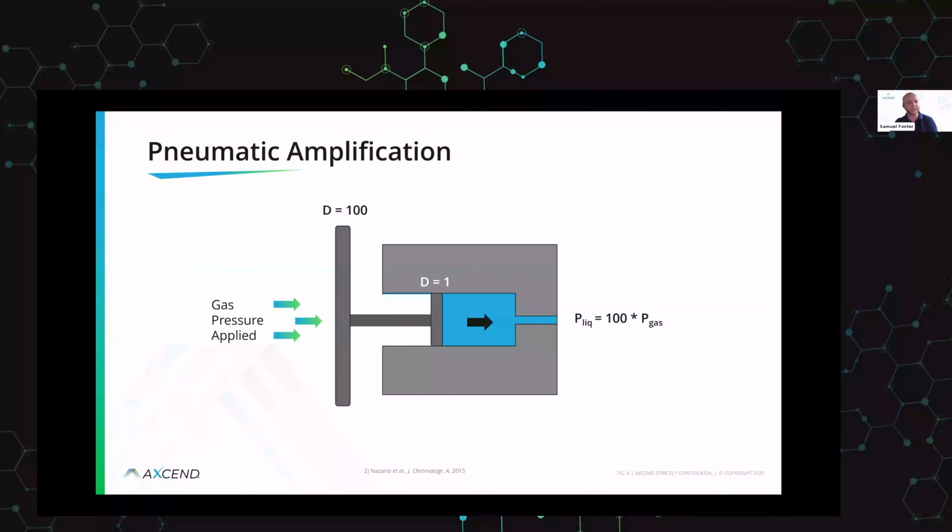And so this is primarily used for a lot of ultra high pressure or very high pressure separations where you're using sub 2 micron or sometimes even sub 1 micron particles with meter long columns, where you can generate 7,000 bar of back pressure, but you can generate hundreds of thousands of plates in a given separation. It's very easy because you can generate these pressures with only a few bar of gas pressure. And so really that's where this system has gained a lot of notoriety, is through its ability to do pneumatic amplification.